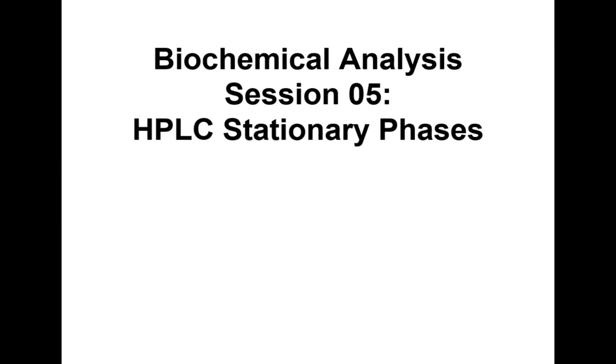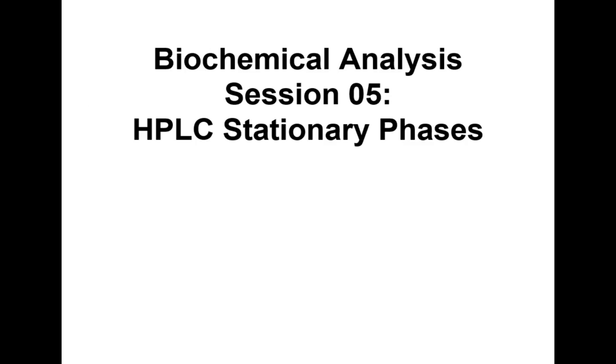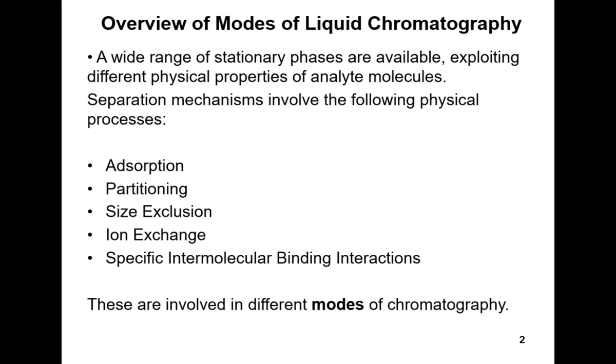So we'll be looking at what's happening inside the HPLC column and how we get separation occurring with normal phase, reverse phase, and a sort of modified version of reverse phase for analysing chiral compounds. I'm probably going to have to leave the ion exchange and size exclusion chromatography to a later session. I'll see how I get on with the timing. I haven't bothered printing out the notes for that yet, but if it looks like I'll manage that, I'll go and print off some extra slides.